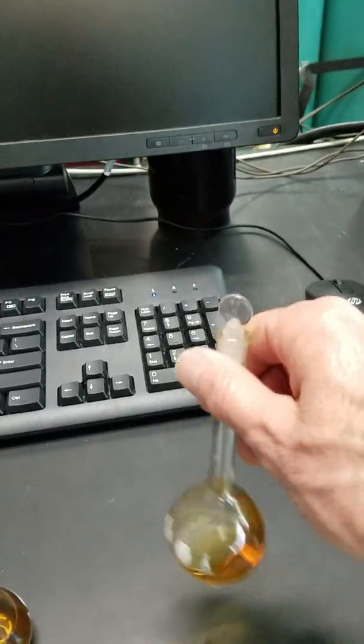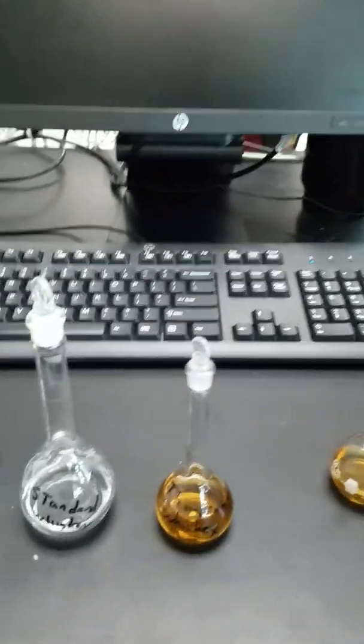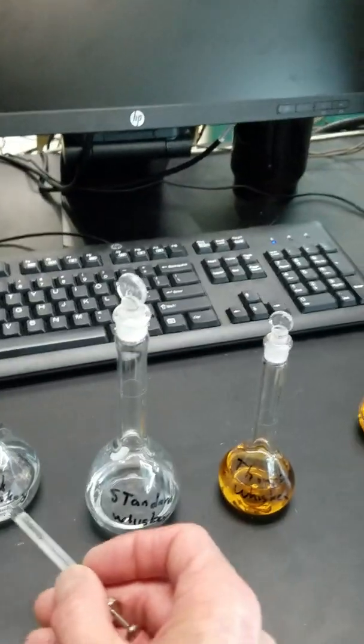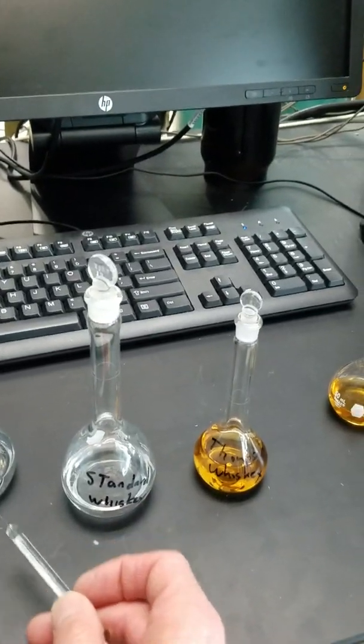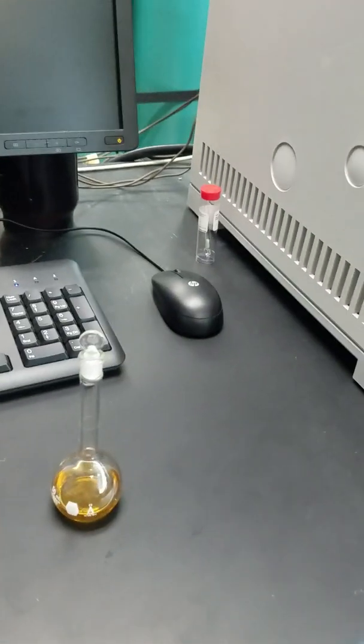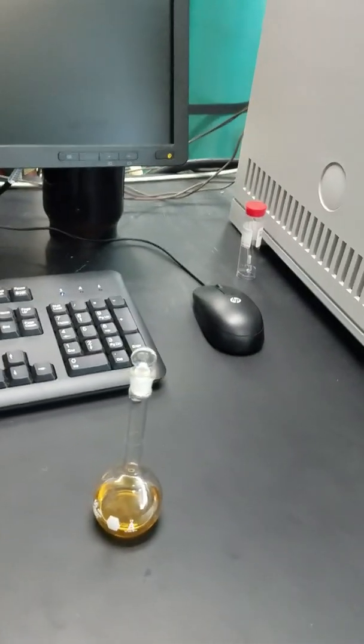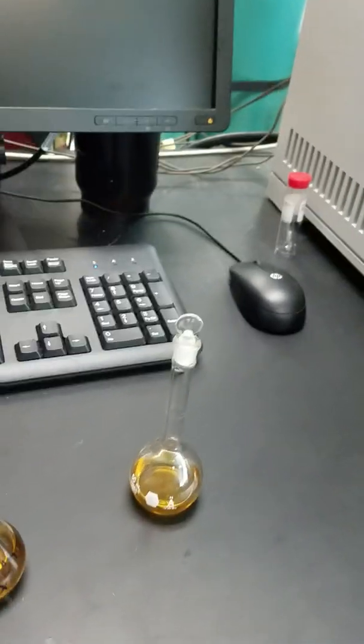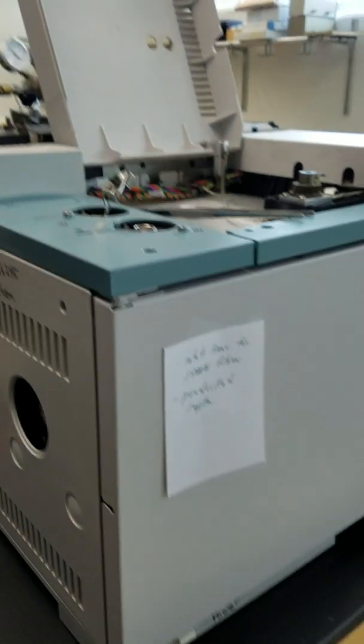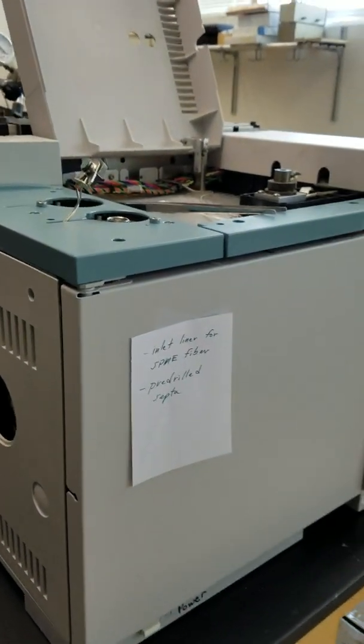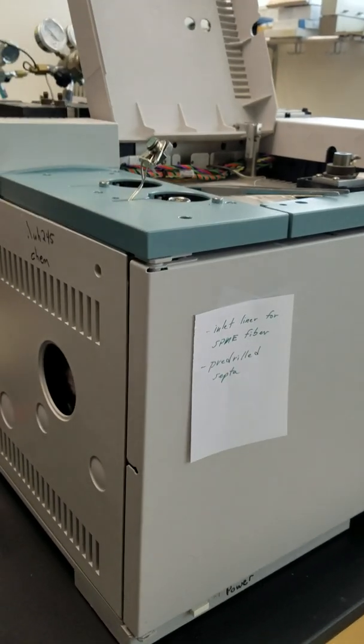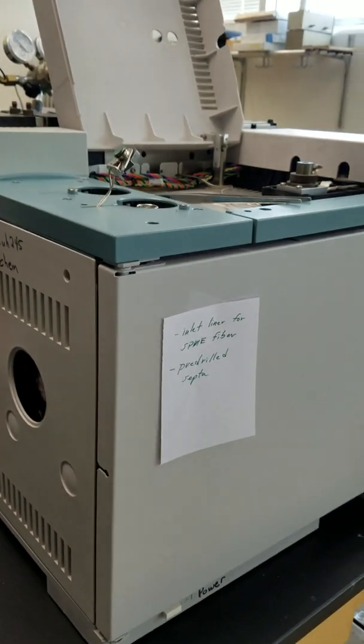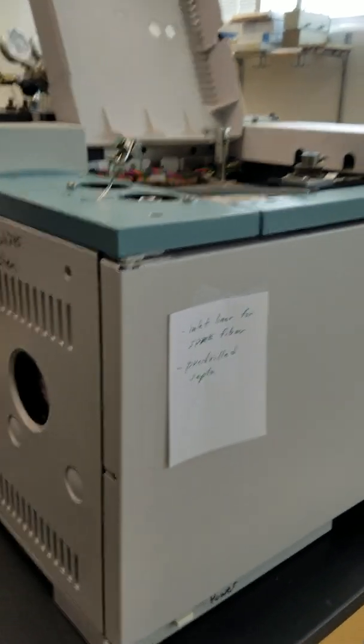We inject the blank whiskey, the standard for the whiskey, and then the whiskey itself into our instrument. We get the chromatograms, analyze them, and determine how much of these impurities are in the Thompson whiskey sample.